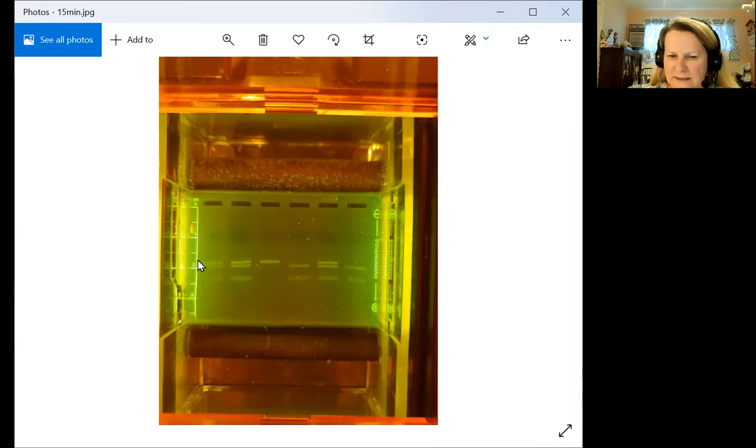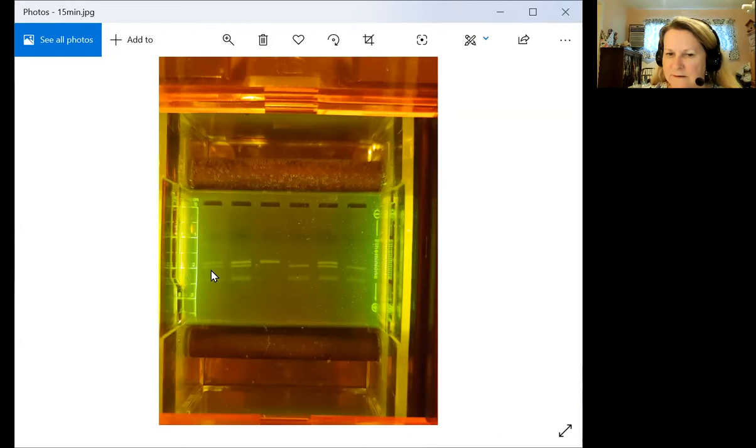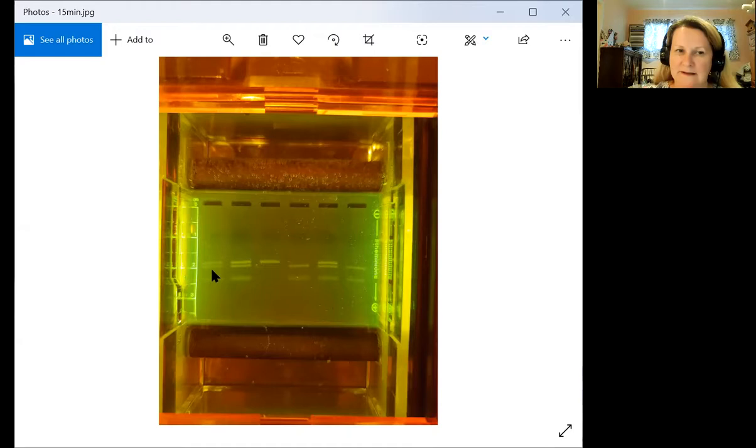If we look at this, remember our first lane was mom and we see two bands here for mom. So mom is heterozygous and we kind of knew that because she had a child who was homozygous recessive. So we knew mom and dad both had to be heterozygous.